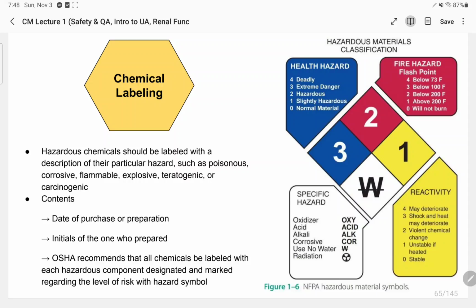Ha? Dapat naka-alamag ang tao nga nag-handle ani para di siya pataka-taka sa handle. Okay, so, unsa may contents ani atong label. Okay, so, date of purchase or preparations. Kanus-a man siya gipalit or kanus-a man siya gi-prepare. Label na din ha. Okay, kinsay nag-prepare, kana siya.